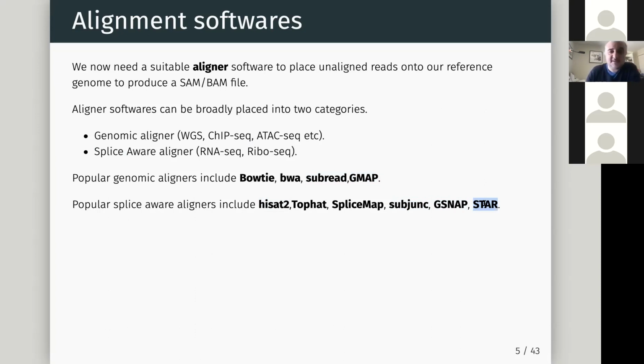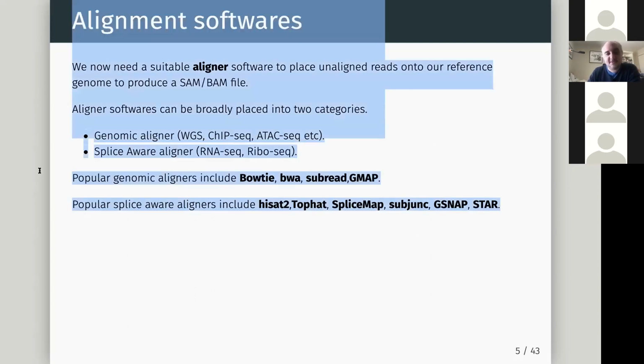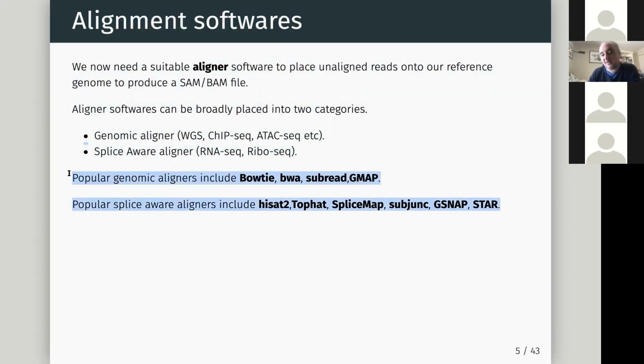I may comment on this as we go along. Again, I may comment on my favorite aligners. You can make your own choices and we can discuss if people want. You can read your papers and make decisions on this, but most of these aligners under the right defaults, right parameters, will give almost identical answers, and trust us that we have done the comparisons.